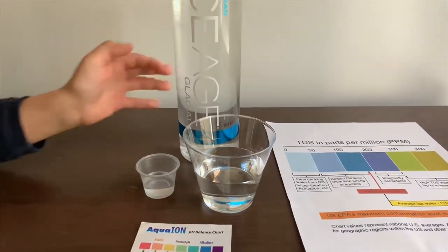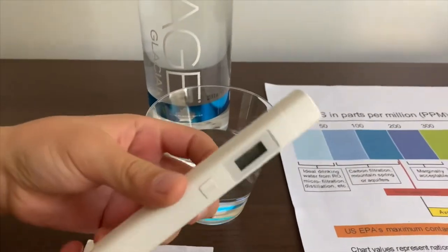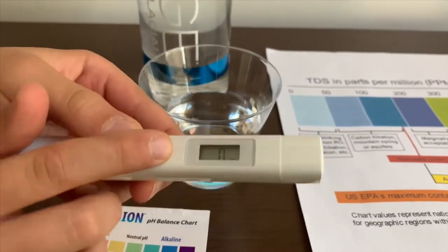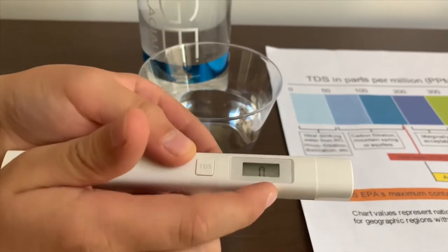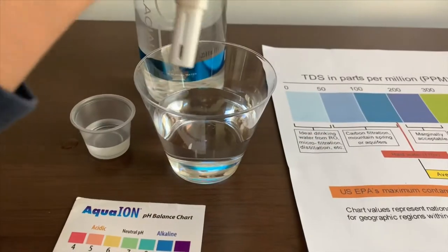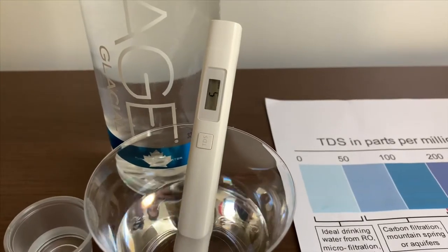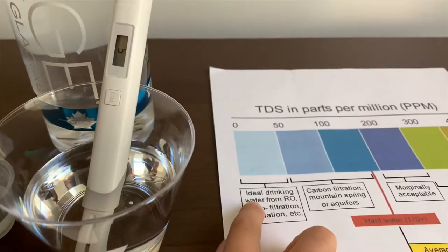First, we're going to test the TDS level. If you want to buy this TDS tester, check the link down below. Turn on the TDS tester, make sure it says 0, and put it in. 5. That is ideal drinking water.